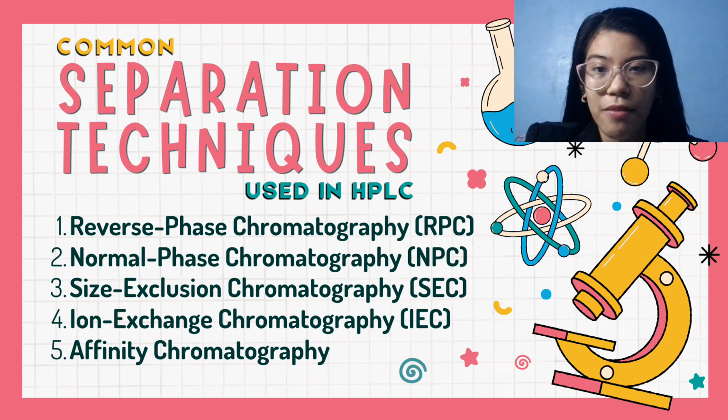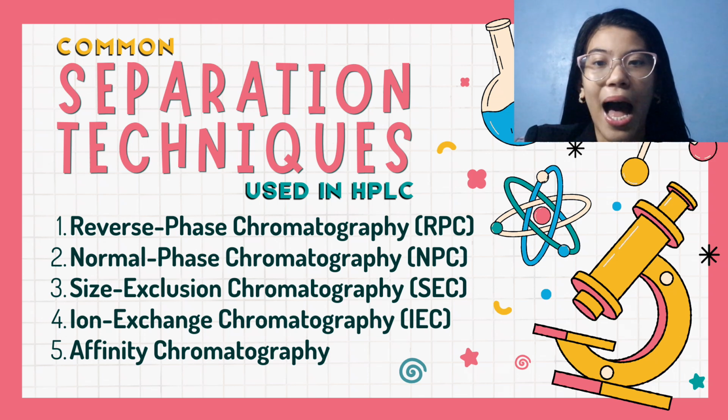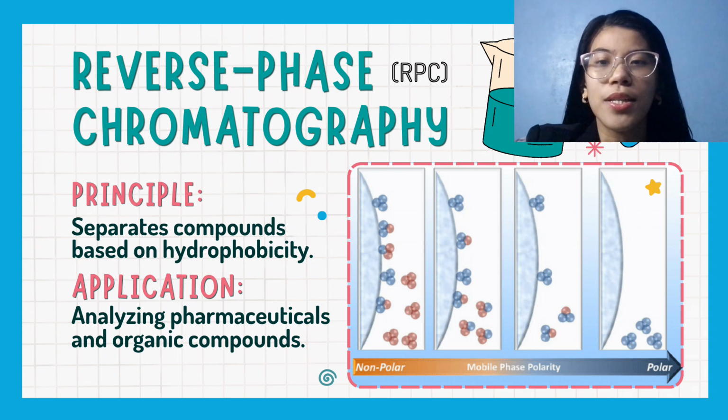Now let's have the 5 common separation techniques utilized in liquid chromatography. We have the reverse phase chromatography, normal phase chromatography, size exclusion chromatography, ion exchange chromatography, and affinity chromatography. Let us first discuss the reverse phase chromatography.